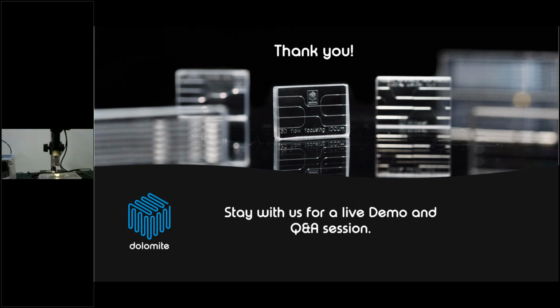Actually, in here, this is our simple single channel microfluidic system. It includes 3 pumps, and the 3 pumps are connected to the chip by using tubing, and the chip here is located under a microscope with a high-speed camera. So every process which happens inside the chip geometry can be visualized under the microscope.